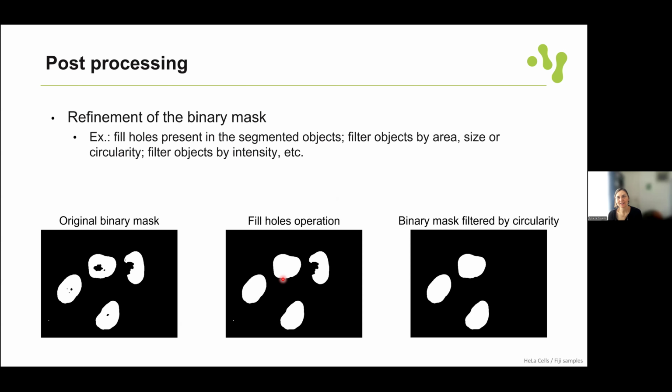When doing things like this, what happens is that you work for hours on this image, and then the next image doesn't work at all with the same settings. So it's important to test the analysis as you're going on many types of images. That's why you need to have a pipeline that you can easily apply so that you can judge. And the other key factor is, don't aim for perfection. You will always have to sacrifice something.